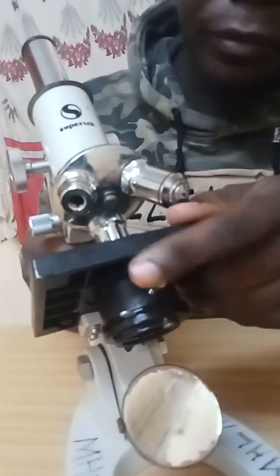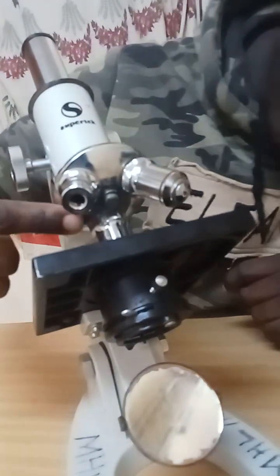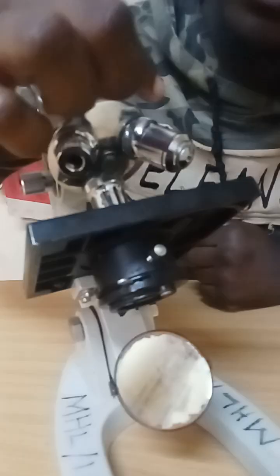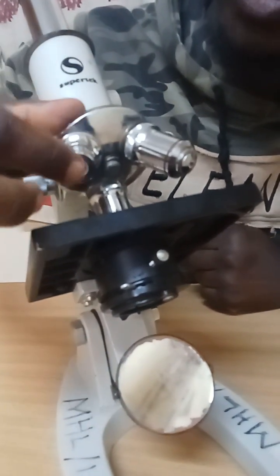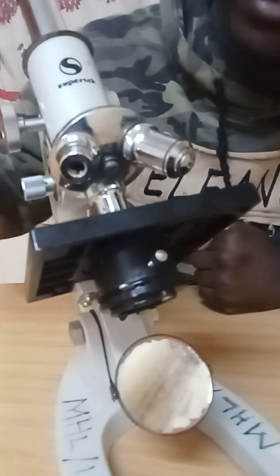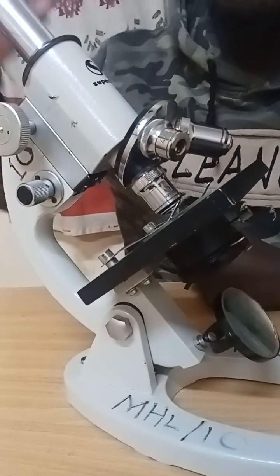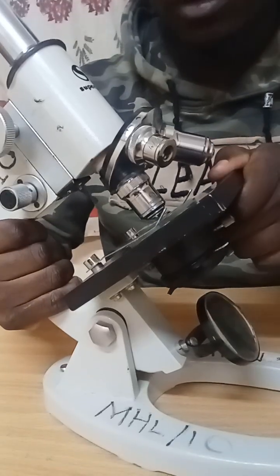Then we have these three objective lenses, and the longest one is called the higher power objective lens. Then the medium one, we call it the medium power objective lens. Then the shortest one, the lower power objective lens. And the role is for magnification, as we've said before. The objective lens magnification times the eyepiece lens magnification, you get the total magnification of the microscope.